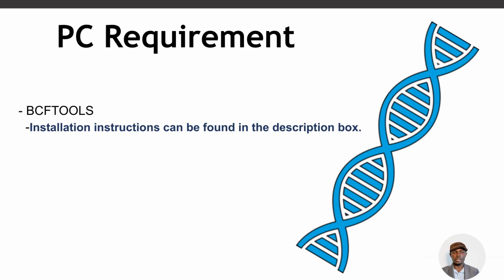Now let's proceed. So there are the PC requirements. We are going to use BCFTOOLS to do this, by the way, so you need to make sure you have BCFTOOLS installed. That's the only thing you need. I have instructions for installing BCFTOOLS, so check the description. You'll find the link to the video. With BCFTOOLS, you can use Conda, Mamba, or Micromamba. You can also install by building from source. That's also another way to do that. Just check the description, where you find links to the different approaches for installing BCFTOOLS.